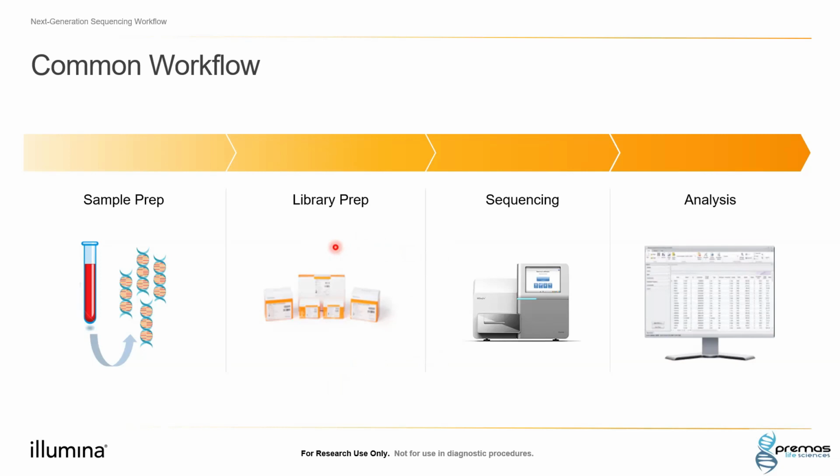Also, any modifications that you do to any nucleic acid, it turns out the library is the same for all the applications. The end library will be the same for all the applications. It is called a library because you fragment it, and then there are many short fragments representing the whole target or the genome that you are trying to sequence. So that's why it's also called a library.